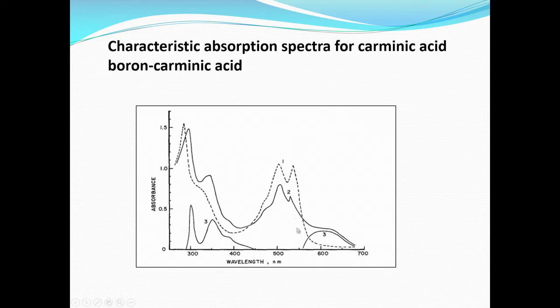So, this peak we are normally monitoring is somewhere here. You can see that the molecular absorption peaks are somewhat complex, but you need not worry about it, because at the recommended range it should be possible for us to determine, within reasonable limits, the specifications of the water sample with respect to boron.